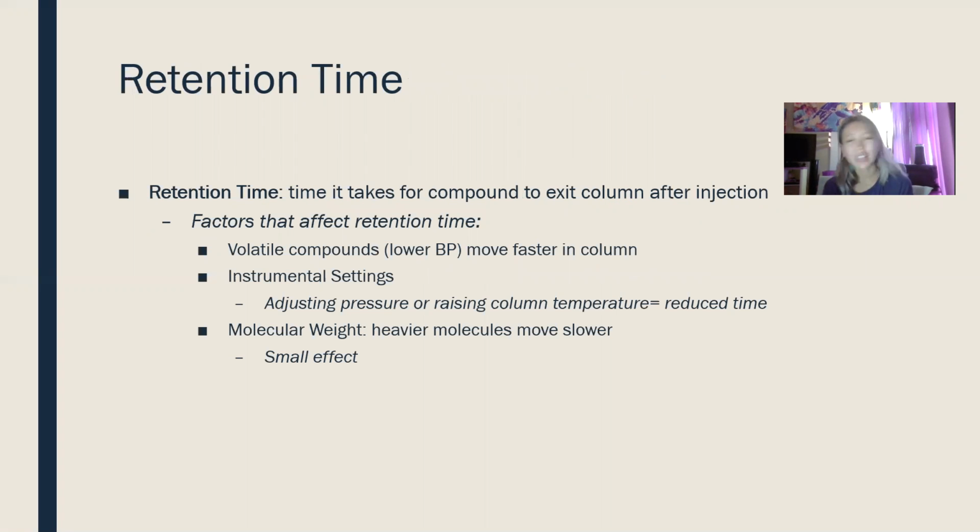The last thing I want to talk about today is retention time. Retention time is the time it takes for the compound to exit the column after injection. As you saw in the video, you have one person injecting and one person starting the LabQuest for your graph. It's very important that you do it at the same time, because that way you're able to see the full graph.